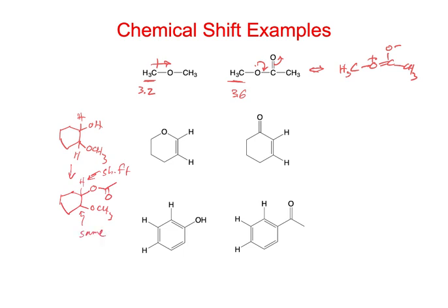All right, and so that can allow you to assign which of these protons is which, because one's going to stay the same, one's going to move. Okay, so that's a chemical way to do it. All right, so these other ones, we kind of talked about these already.